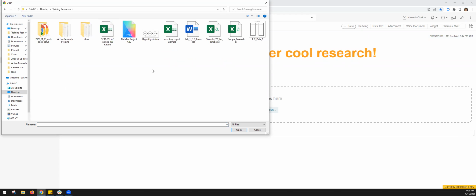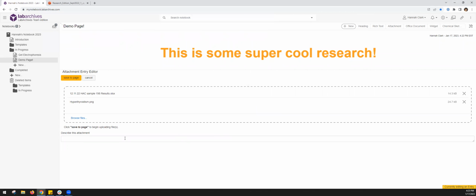So it can actually be a lot of attachments that I add to my notebook very, very quickly. And maybe I want to add an image, an office document here. And a good practice, especially when we talk about good research and good work that's done, is to add a file naming convention with your team. This is something that might be included in a data management and sharing team plan. And you can have good descriptions for your files. You can include this description field to provide more details. Maybe the software or hardware used to create the file, or other details like that to help you keep track of the work that's created, who put it in the notebook, how it was created, and so forth.